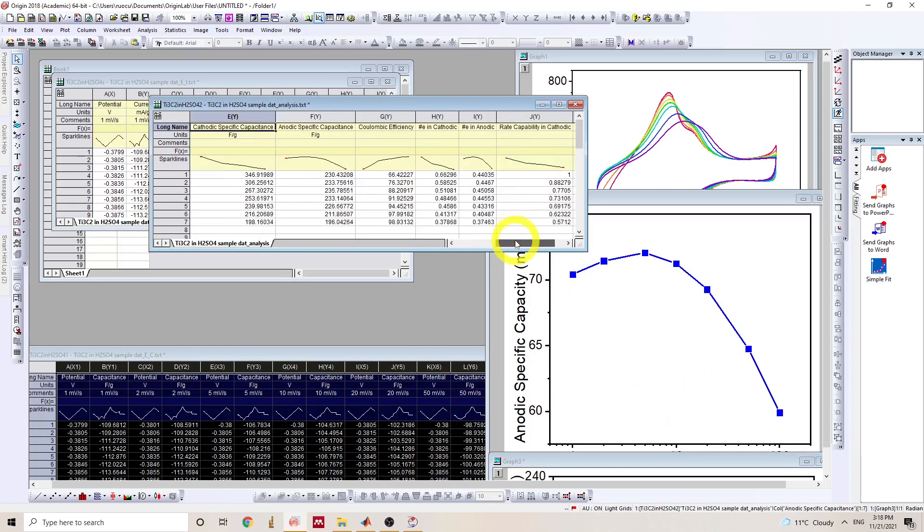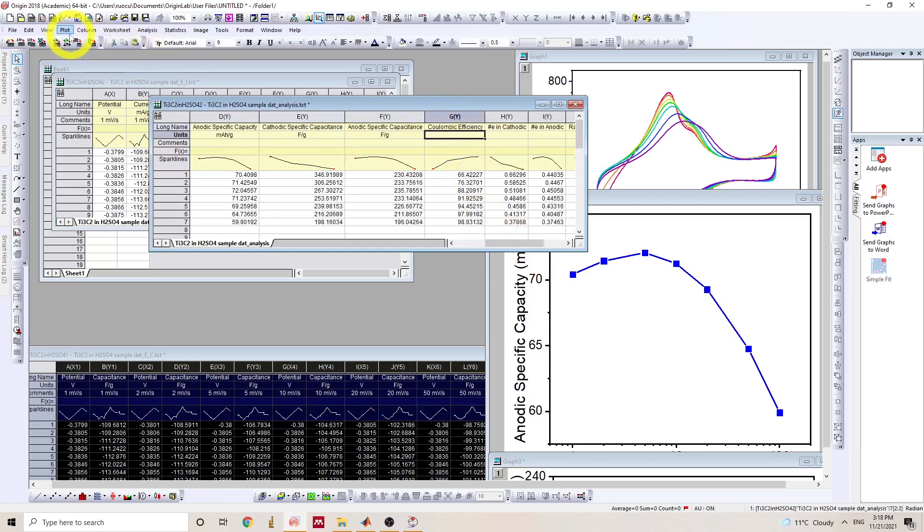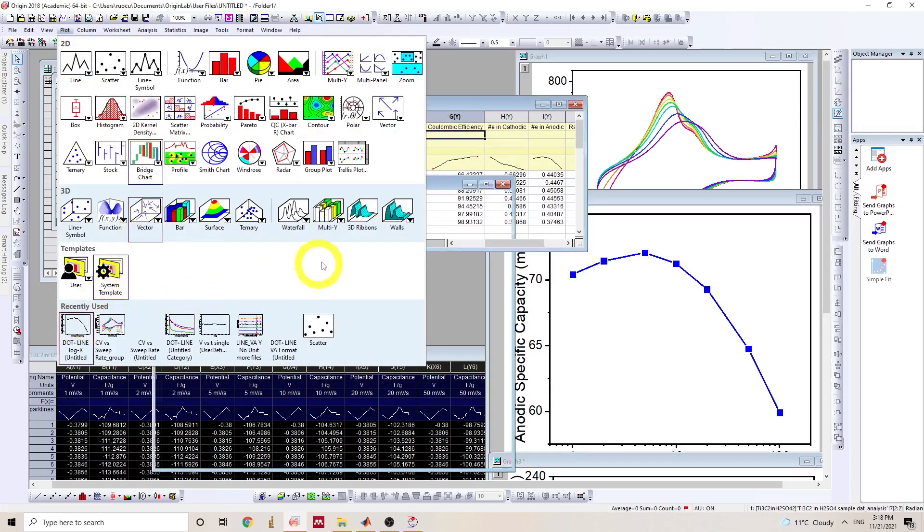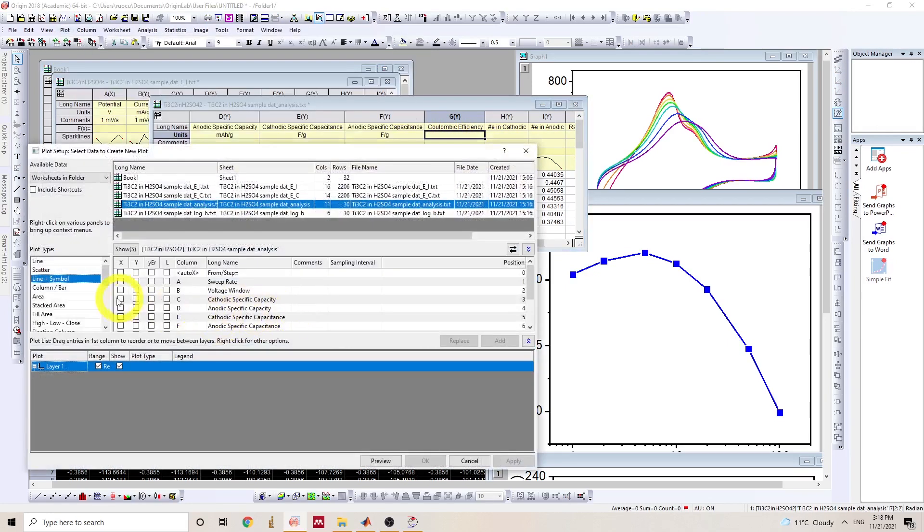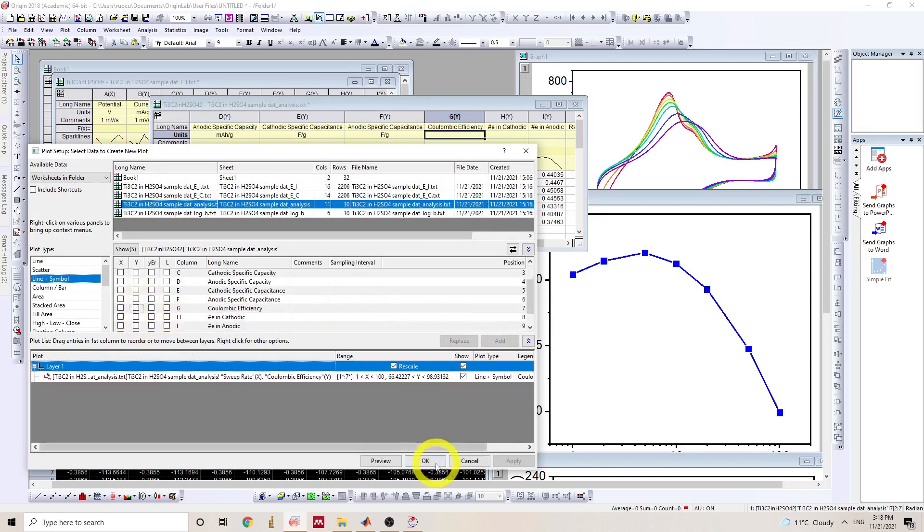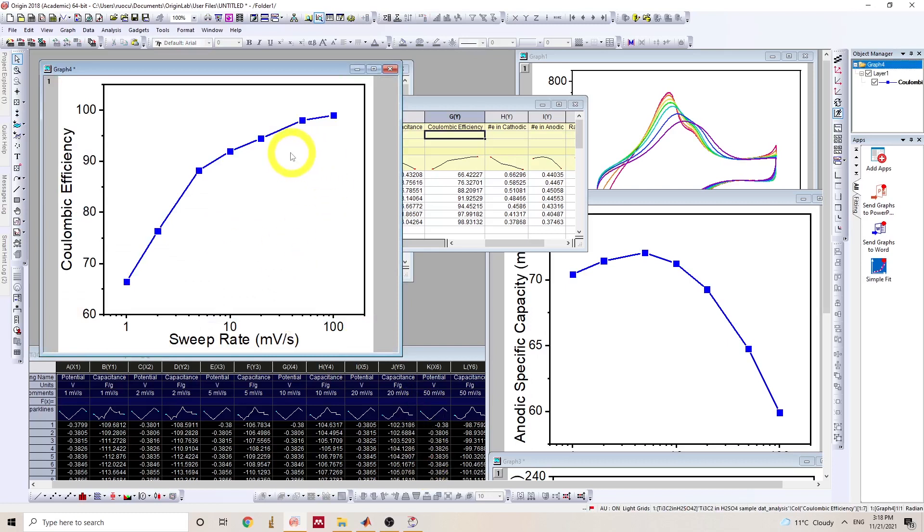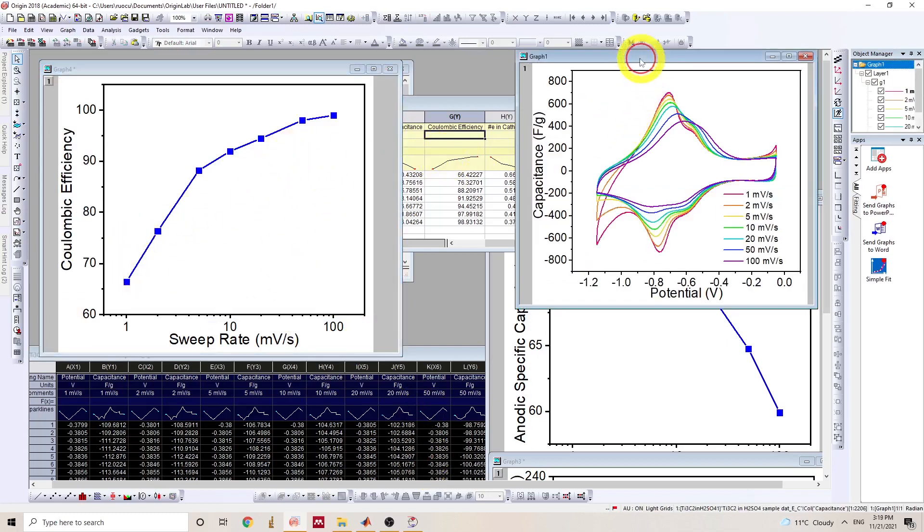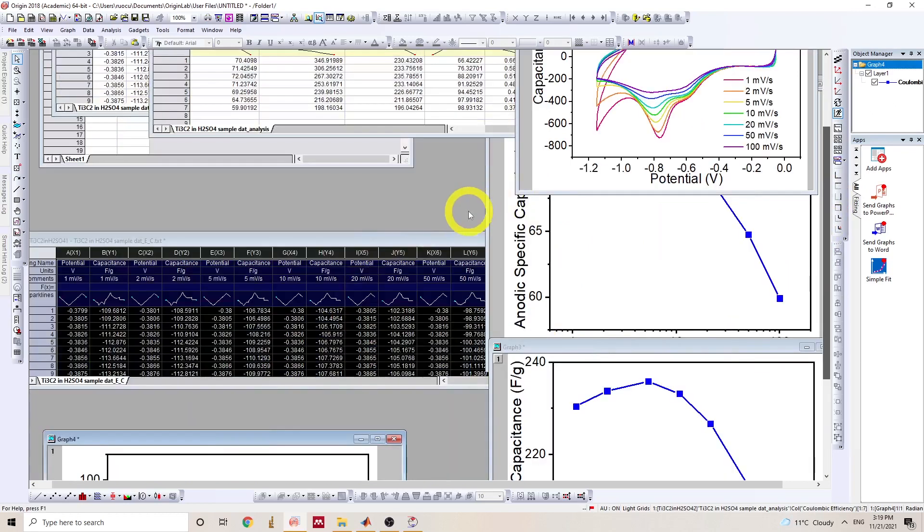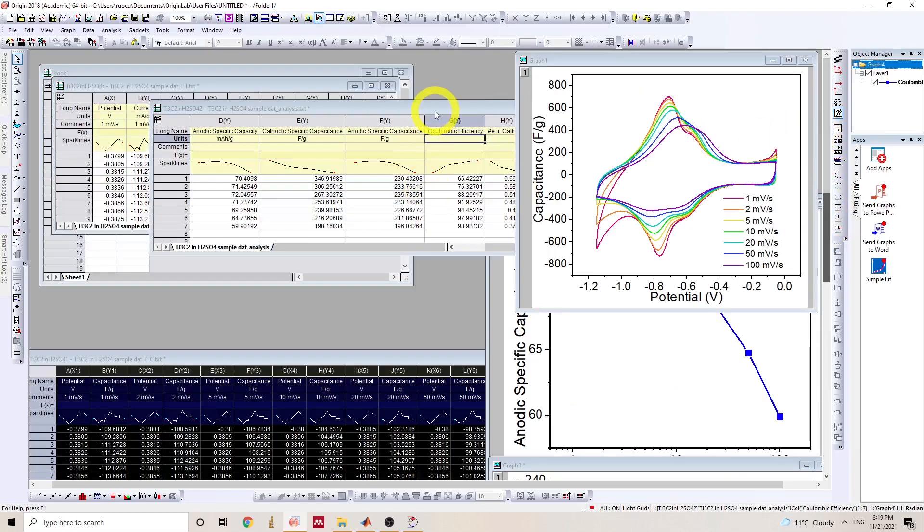And coulombic efficiency is another important one. Coulombic efficiency. Here we go. Yeah. So the coulombic efficiency increases as a function of sweep rate because at higher sweep rate, the hydrogen evolution is kinetically suppressed. So I have gone through two data files.